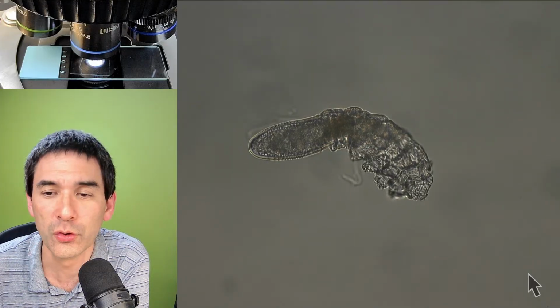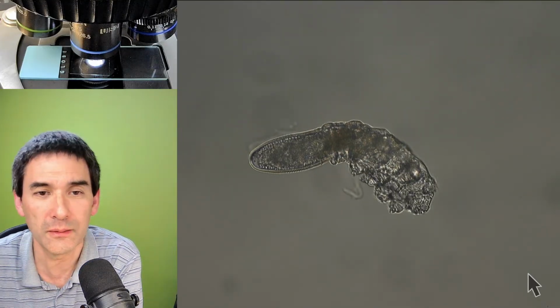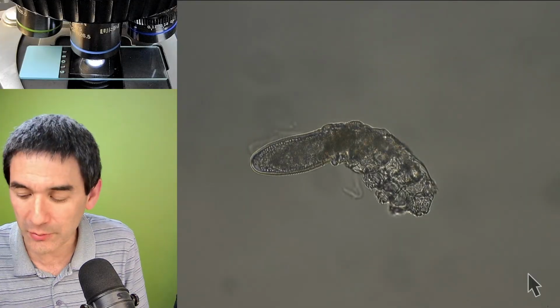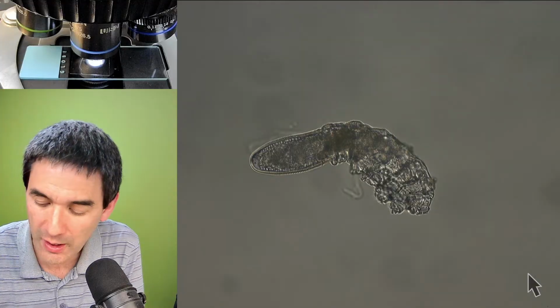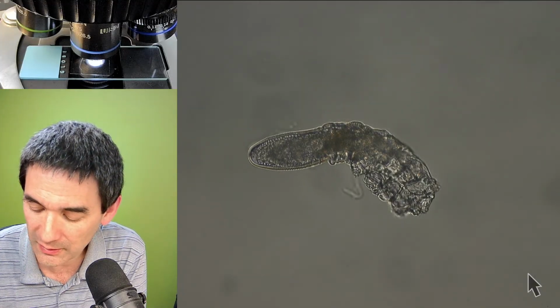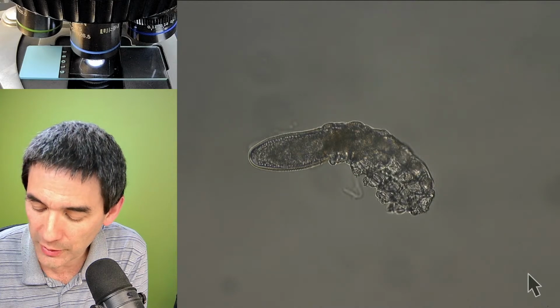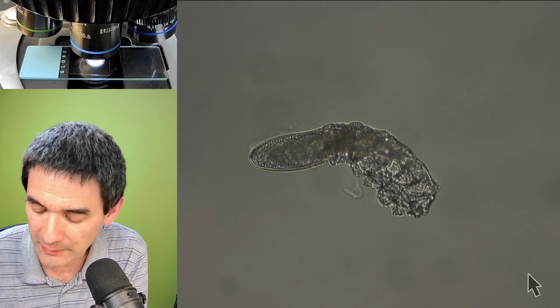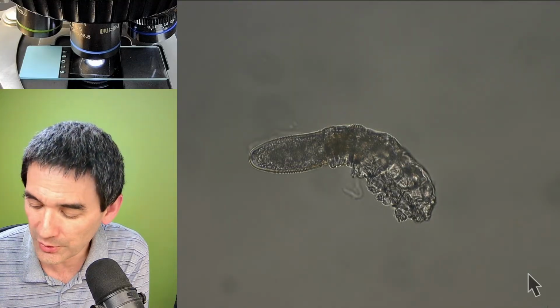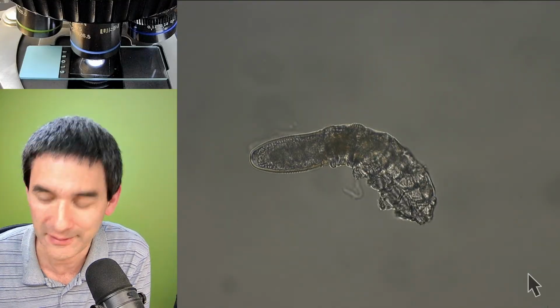For those of you who maybe joined in a little bit later, while I keep this running here, I'm just going to quickly demonstrate how I was actually collecting them. We basically already did 3 trials. The first trial I was not able to collect any, unfortunately, or find one at all. And the 2 other ones where I prepared them, they already died.